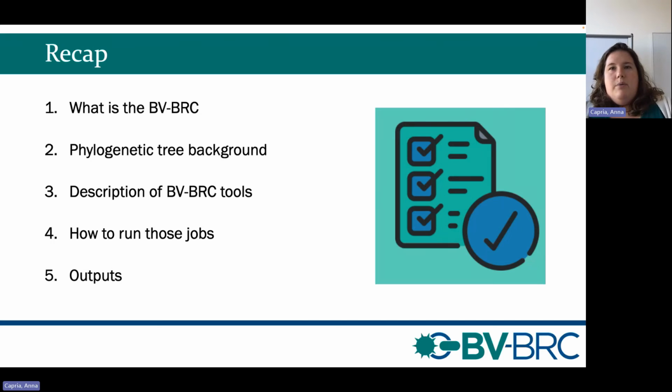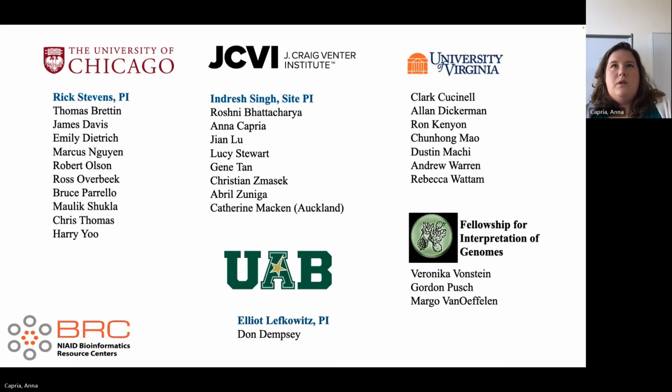So to recap this very quick introduction to the BV-BRC, I gave you some background on phylogenetic trees, a description of the BV-BRC tools, how to run the jobs in the BV-BRC, and then the standard outputs. The BV-BRC project is a combination of 4 institutes. So we have the University of Chicago, JCVI, University of Virginia, University of Alabama, and you're funded by NIAID.